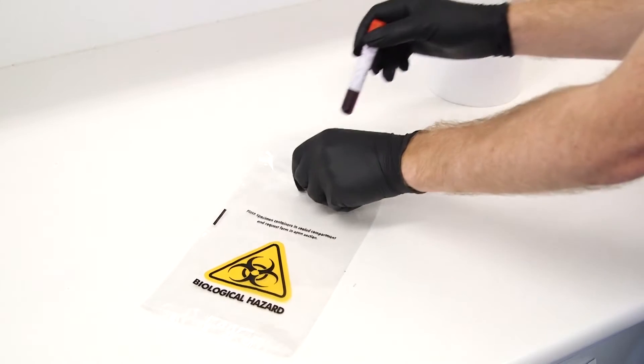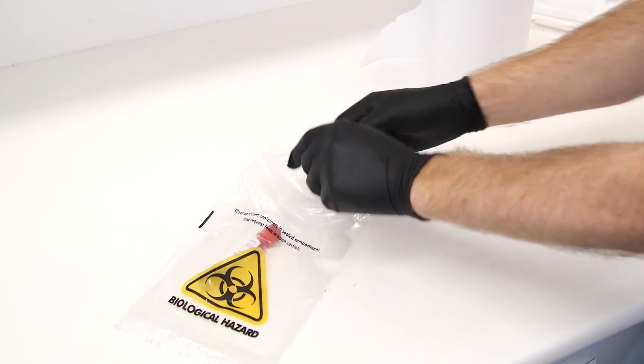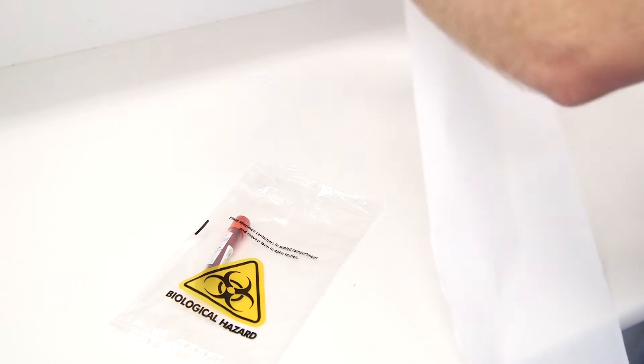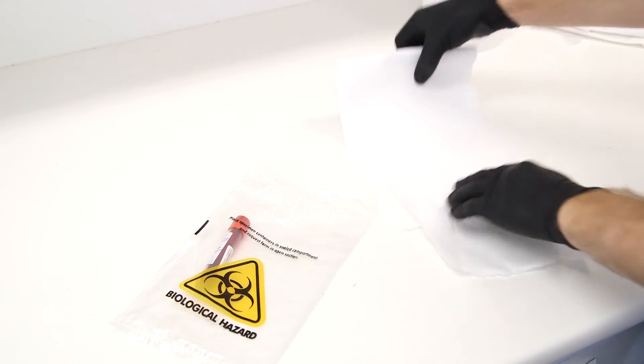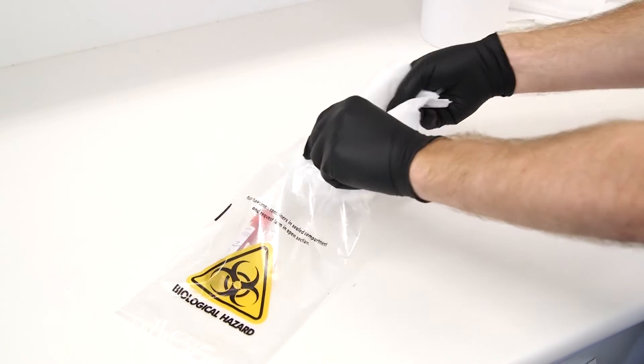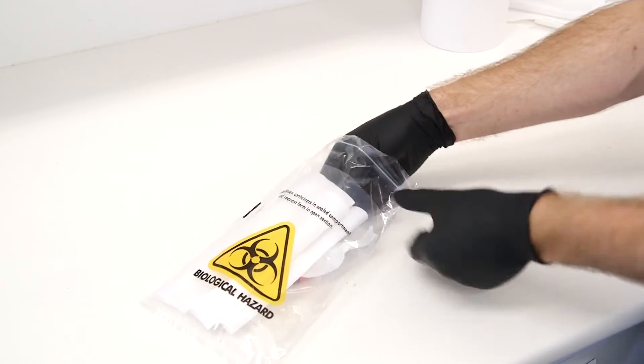You must always label the primary receptacle with the identification of the animal or plant that's being tested. Then place the primary receptacle into leak proof secondary packaging. Secondary receptacles include screw top plastic containers, biohazard bags or zip lock bags. Include enough absorbent material within the secondary package to absorb the entire contents just in case.